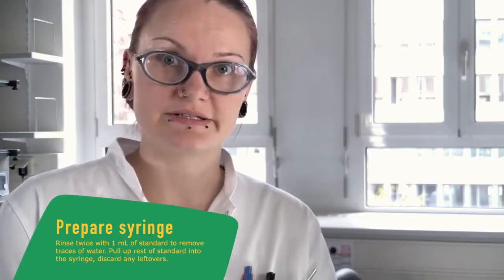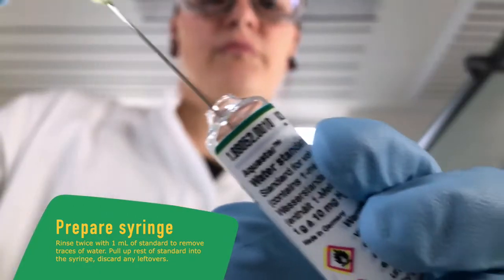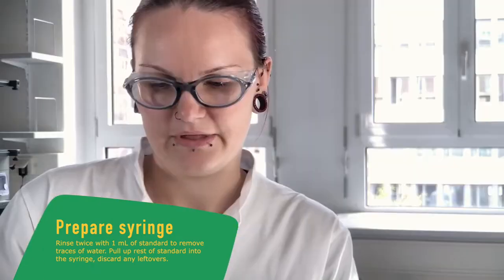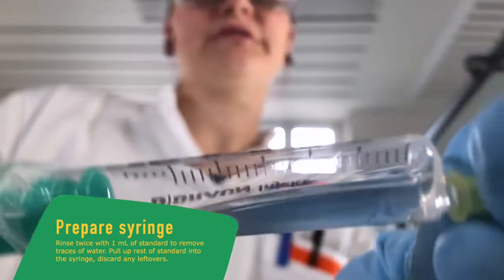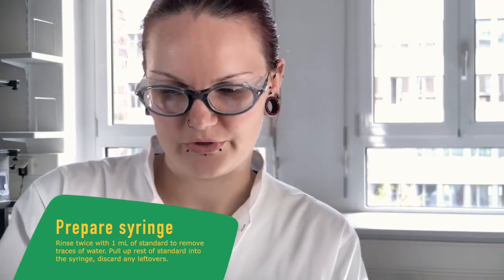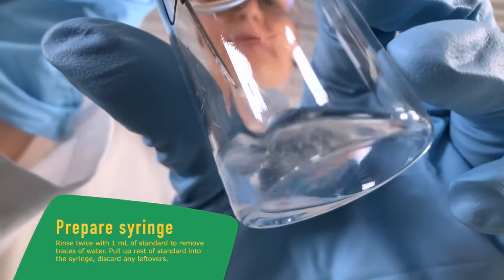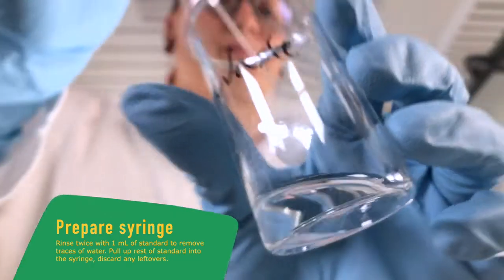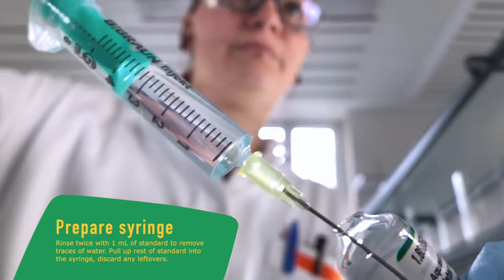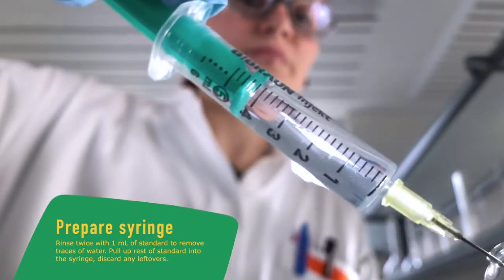and we repeat this again to rinse the syringe again. We pull up about 1 milliliter again and then shake it again to get the water from the syringe out. Put it in the waste. After this, we pull up the rest of the ampoule into the syringe.